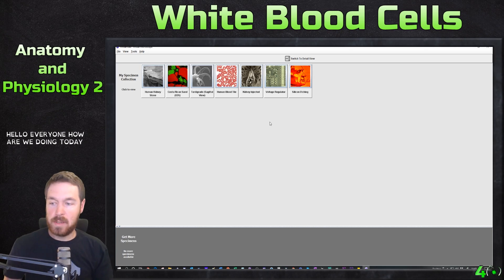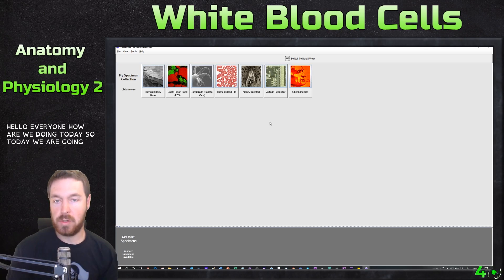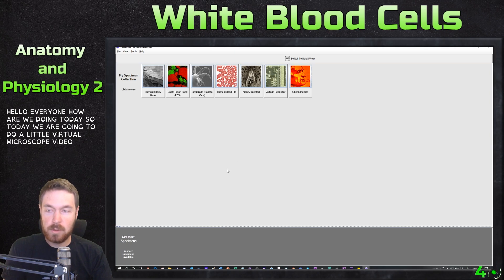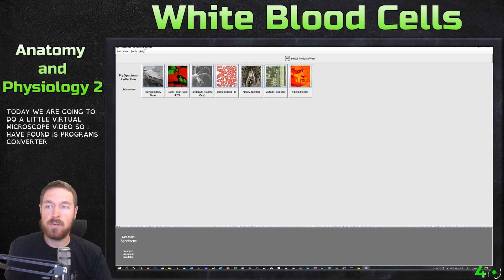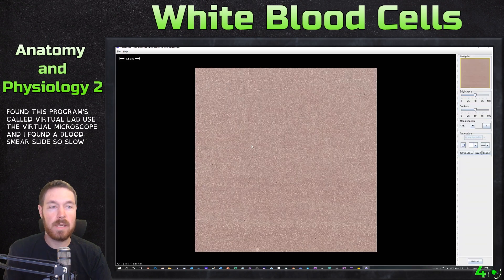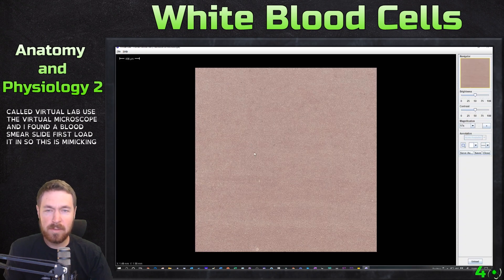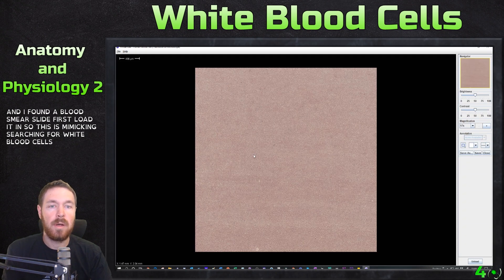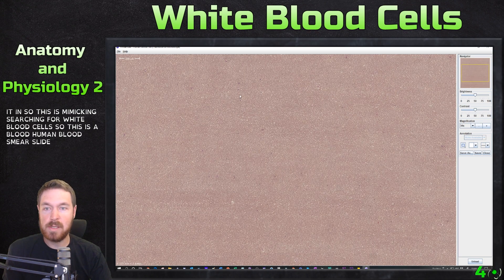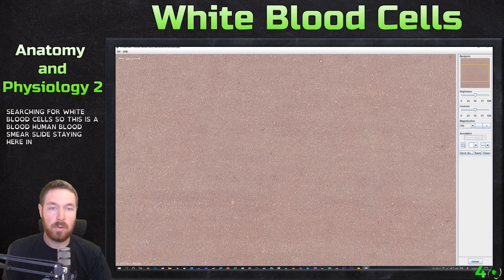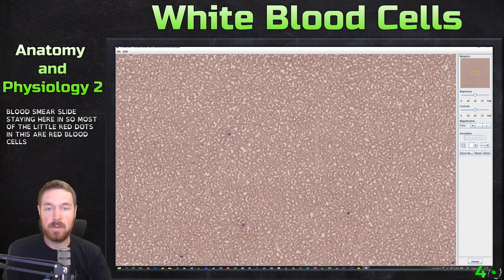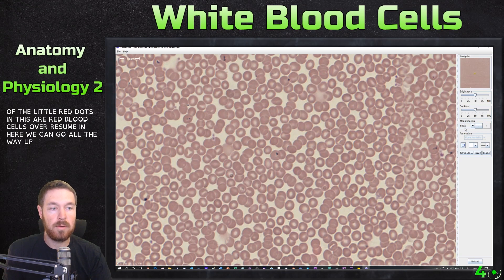Today we're going to do a little virtual microscope video. I found a program called Virtual Lab that uses a virtual microscope, and I found a blood smear slide to load in. This is mimicking searching for white blood cells. This is a human blood smear slide, and most of the little red dots are red blood cells. If we zoom in, we can go all the way up to 550 times magnification.